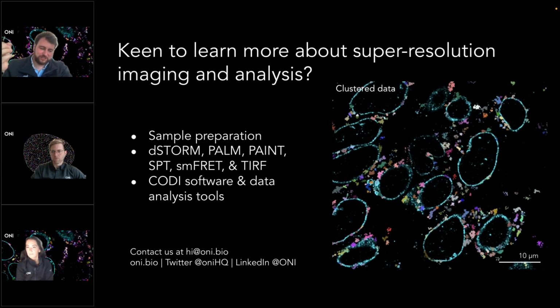That's because the data is stored in the cloud, and we only present a small subset of the localizations as a visual preview. If you zoom into any area in the data set, you'll see the individual localizations, and it will pull in sort of in a Google Maps style, where you don't see every single road name when you're zoomed out at the country level. As you zoom into any area in your data set, the cloud will fetch more localizations for you to see.